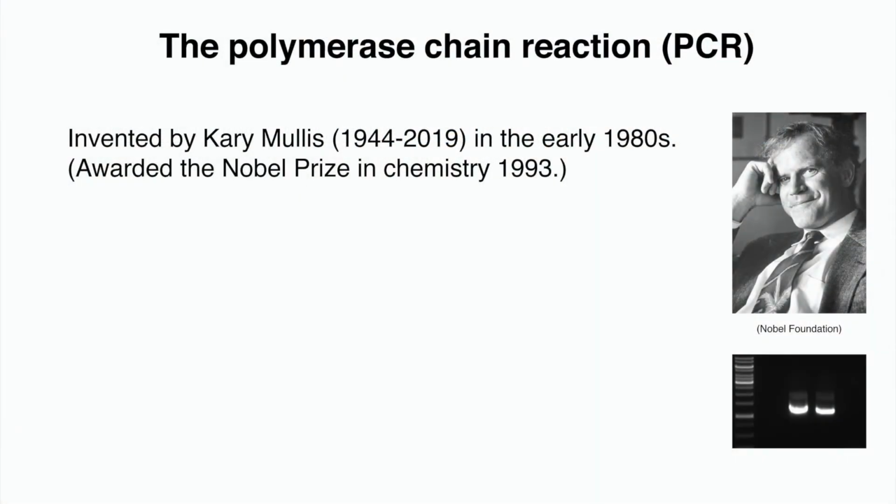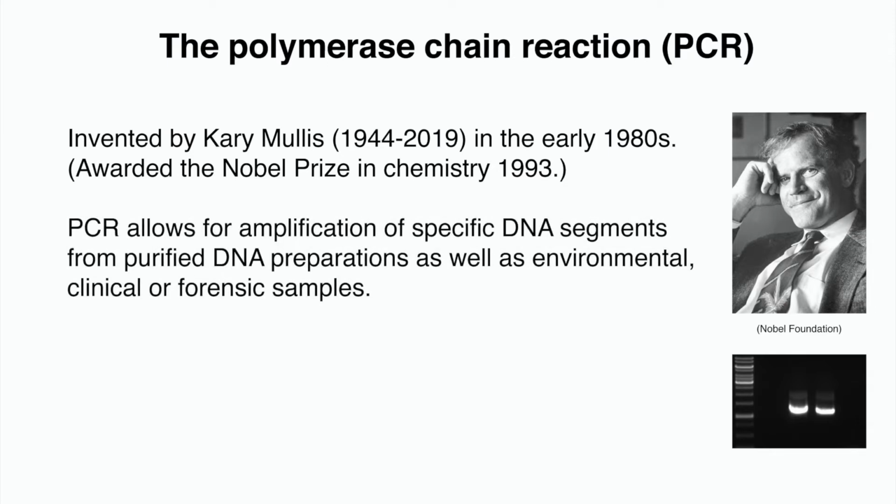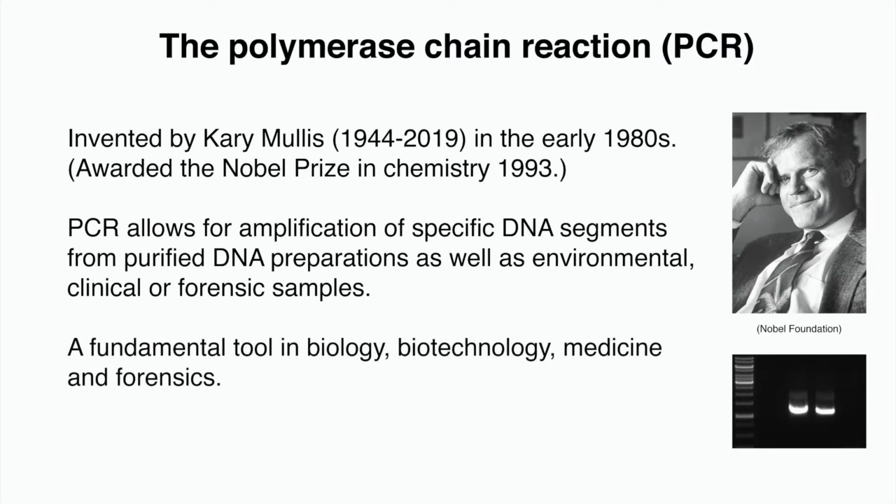The polymerase chain reaction, or PCR, was invented by the American scientist Kary Mullis in the early 1980s. PCR allows for amplification of specific DNA segments from purified DNA preparations as well as environmental, clinical, or forensic samples. Today, PCR is a fundamental tool in biology, biotechnology, medicine, and forensics.